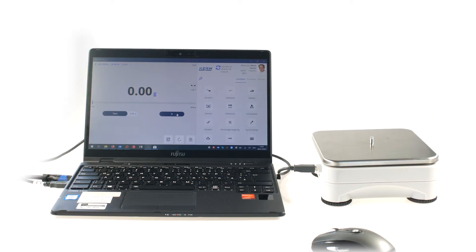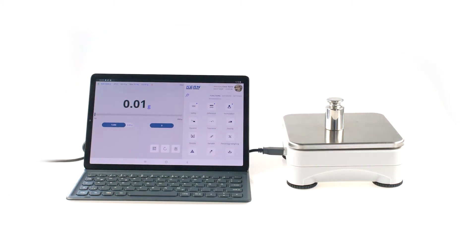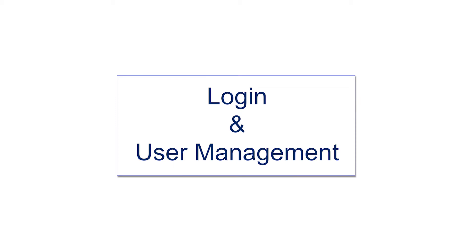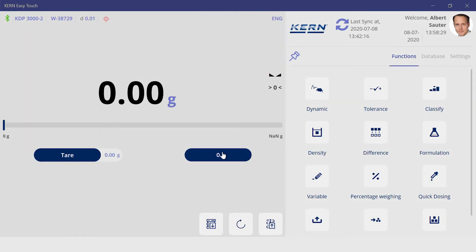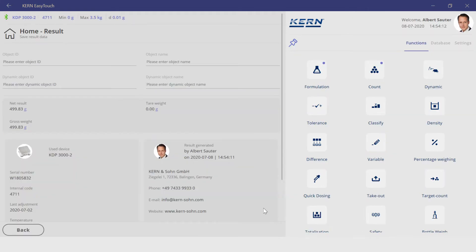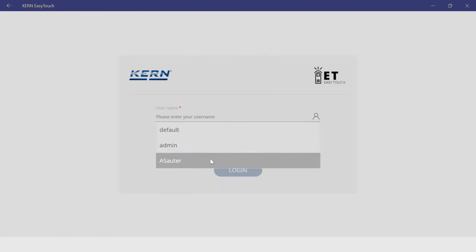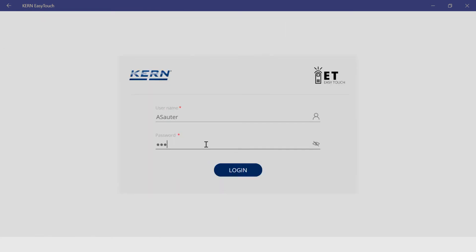Easy Touch can be used on Windows PCs as well as on Android tablets. In both cases, the user operates the scales via the tablet or the PC. By using the scale via the PC or tablet, the weighing process can be carried out more safely and supported with more data. For example, the software can be set so that each user must identify himself in order to be able to trace weighing data unambiguously.